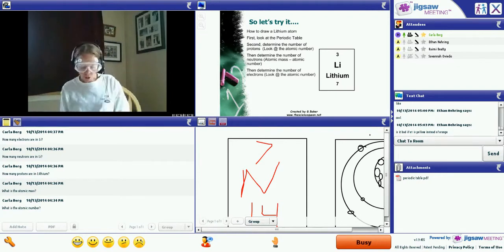While we're letting them sit, we can fill in our data table and start moving on. Step number 5 says fill in table 4.1 with the number of drops of copper nitrate and potassium iodide in wells A1 through E1.